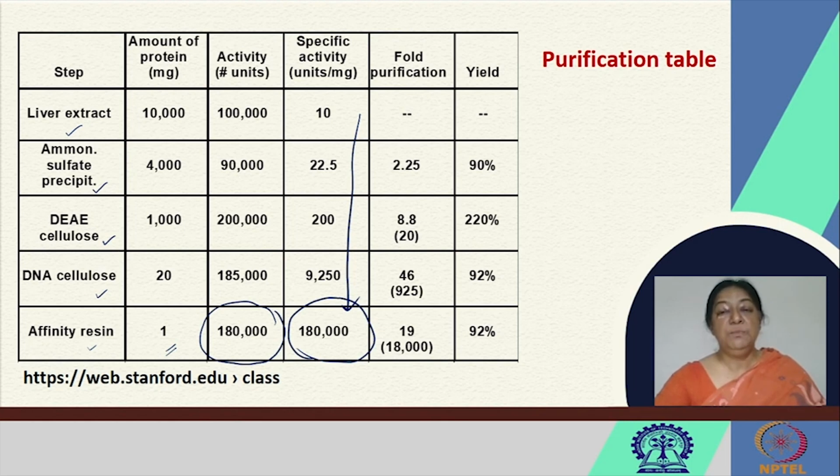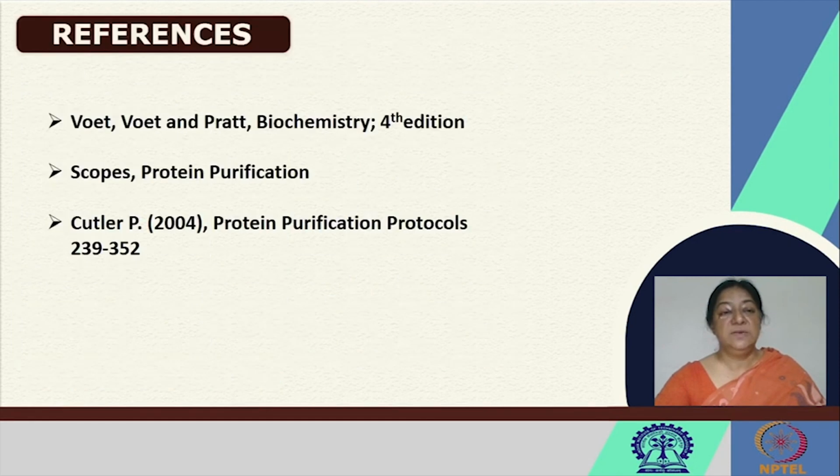So we learned how we can purify proteins using chromatographic techniques. These are the references.